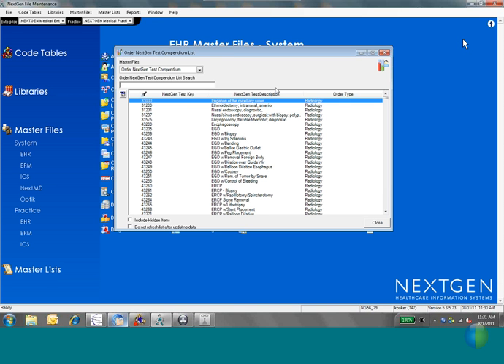And by the way, I don't think I mentioned this before: since you might have multiple vendors, you need to link every single test for each vendor. So even if you've done the lipid panel for LabCorp, you need to do the lipid panel for Quest as well. Each test has to be linked to the next-gen compendium for it to be all one universal list.